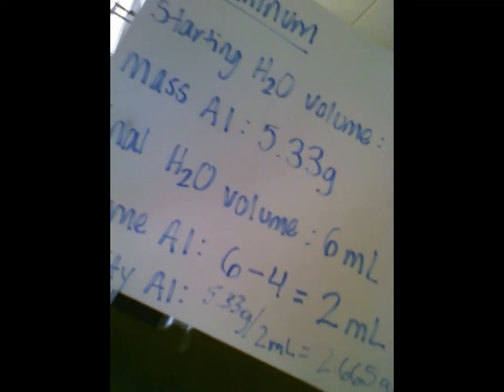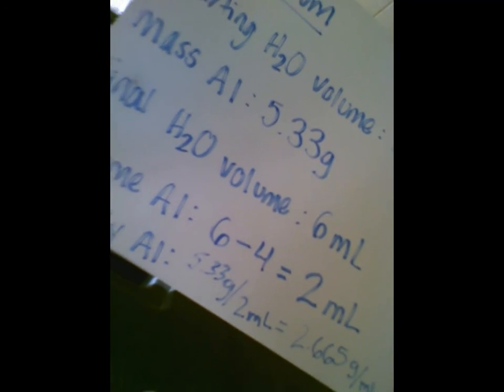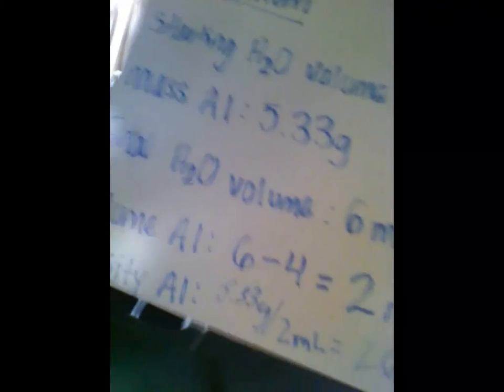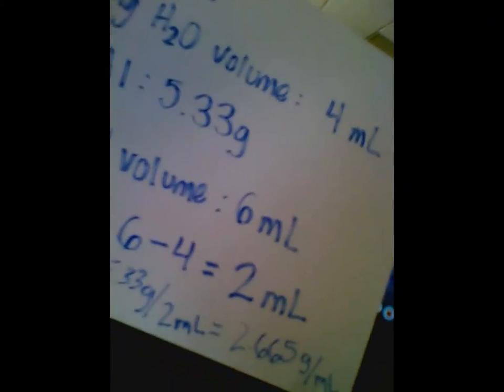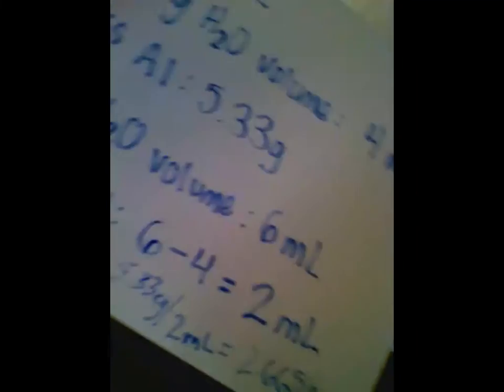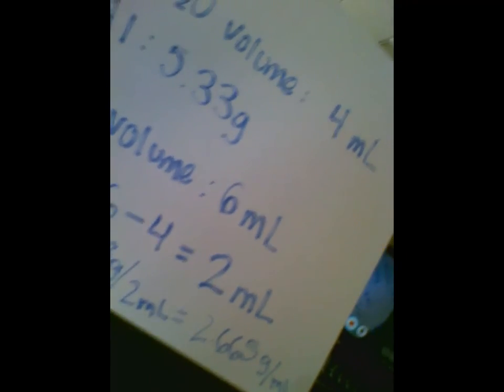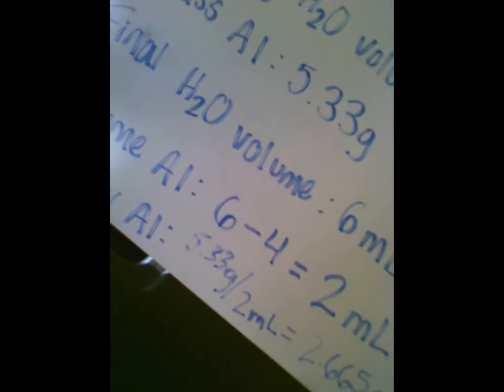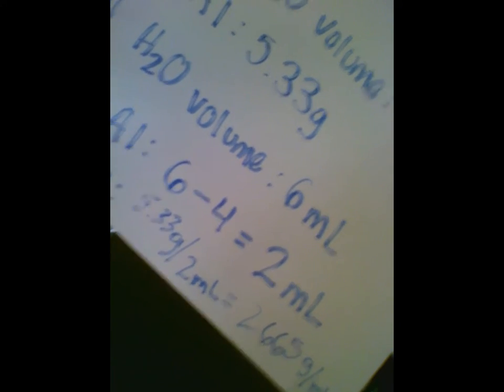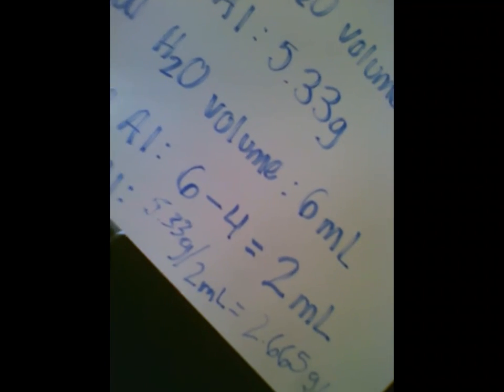For the next one, you are going to do this on your own. I'll give you the pictures, you're going to fill out the data table, and you're going to calculate the density. We are going to do copper next. And then for our third one, you are going to have to do a little detective work, a little problem solving. I am going to give you the work that somebody else completed, and you're going to have to determine: did they do it right? Did they do it wrong? If they did it wrong, what went wrong? We'll see if you can pick up on how somebody else does the lab. So again, next you're going to practice with copper, then you're going to do that detective work with zinc, and both of those will be submitted in your understanding check form at the end.